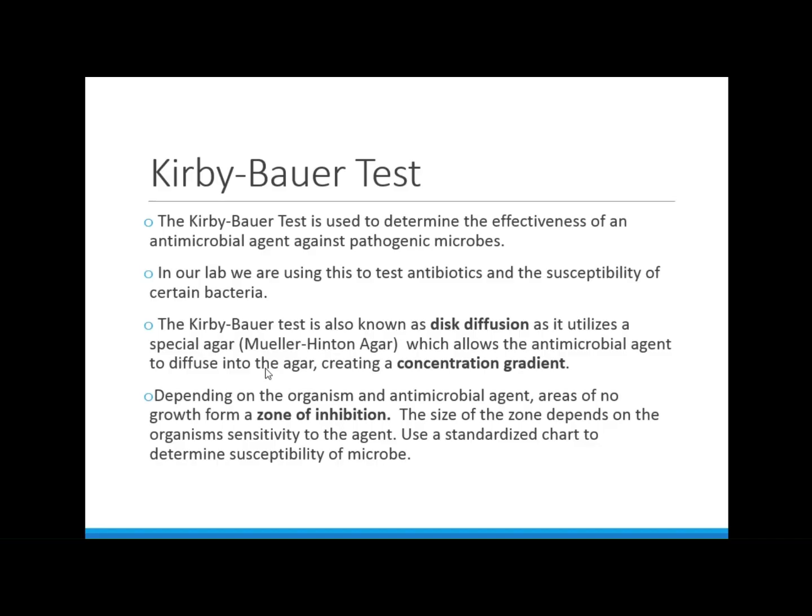So in lab, you're going to be looking at 4 different antibiotics to see if your bacterium is susceptible, which is going to be: is it susceptible or resistant? Now I'm going to stop here for just a second, because we're doing this virtually, you're going to be prescribed a particular bacterium. I'm going to send that to you through an email, and you're going to be told the 4 different antibiotics that you're going to be performing this test on virtually.